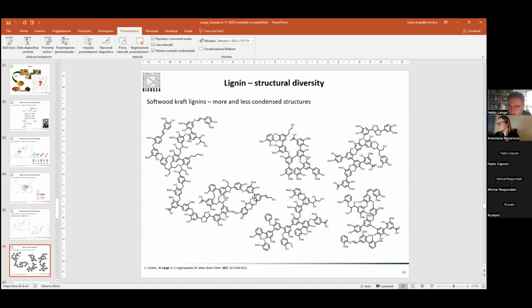Yeah, so I got interested in this quick quantitative HSQC, the QQ HSQC. I've been running some quantitative HSQC from the Helsinki group. I think they base it on this QQ HSQC experiment too. Are you aware that Bruker has that in the sequence? No, Bruker doesn't have it. You have to, the sequence is published though. Okay, so I can obtain that from the authors.